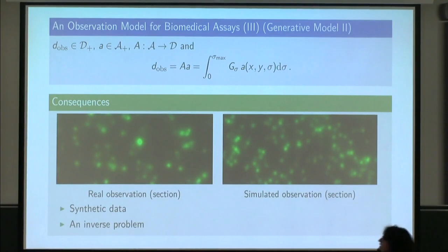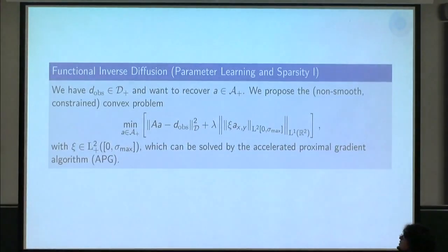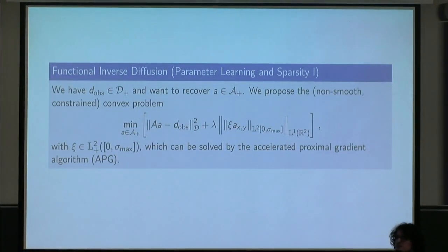A disclaimer here is that this image is generated by a fluorophore, and then it's captured by an optically filtered wavelength and a color camera behind it, while this image is just a grayscale image that we generated using our model, loaded into the green channel to make better comparisons. Another disclaimer, this image includes an extra blur to model an imaging system that was not perfect, and also additive noise. So, keeping on, of course, the biggest application of this will be to set up this inverse problem.